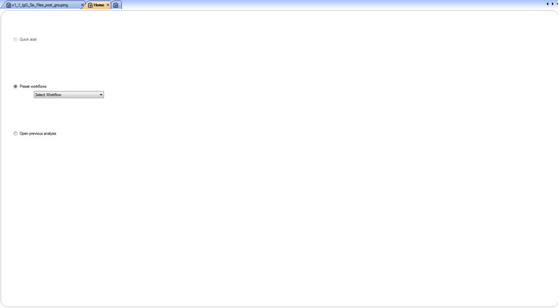This is a Pinnacle how-to video demonstrating the antibody screening and quantitation workflow. The purpose of this video is to provide an overview of the workflow, and we'll cover just the general concepts of antibody screening and quantitation. For specific functionality contained within or referred to within this video, there are specific help files and videos that you can access.